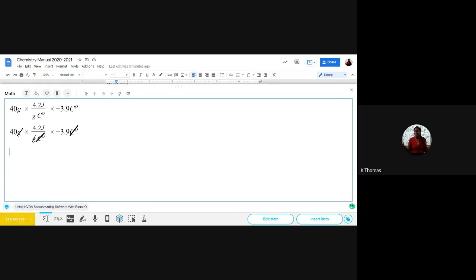Perfecto. So now I have 40 times 4.2 joules times negative 3.9.